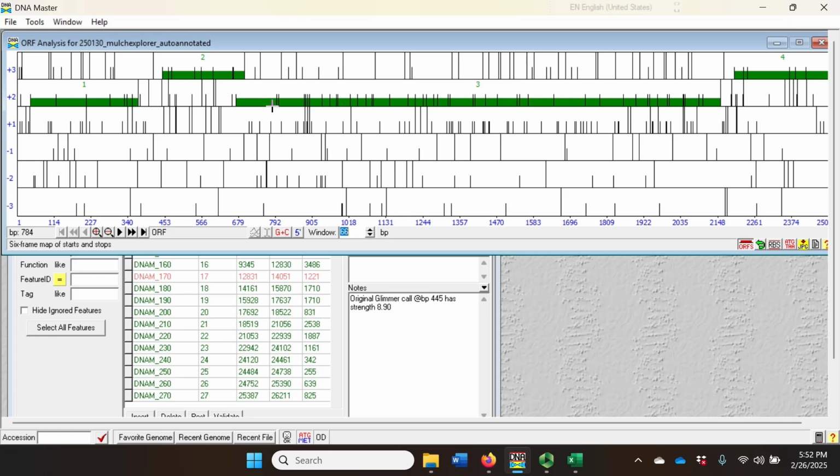Now, generally speaking, you're going to pick one of the earlier start sites because we have all of this great open reading frame, this region that's clear from stop codons. We don't want to waste that by starting the gene somewhere in the middle. We're going to use all of this clear open reading frame and take advantage of that to make our protein. But of course, the first start site is not always the correct start site. Very often it isn't. So we have to distinguish which of these start sites we are going to select. But you can generally assume it's probably going to be one of the first few, maybe 5, at least 10 start sites in the gene is a pretty fair assumption.